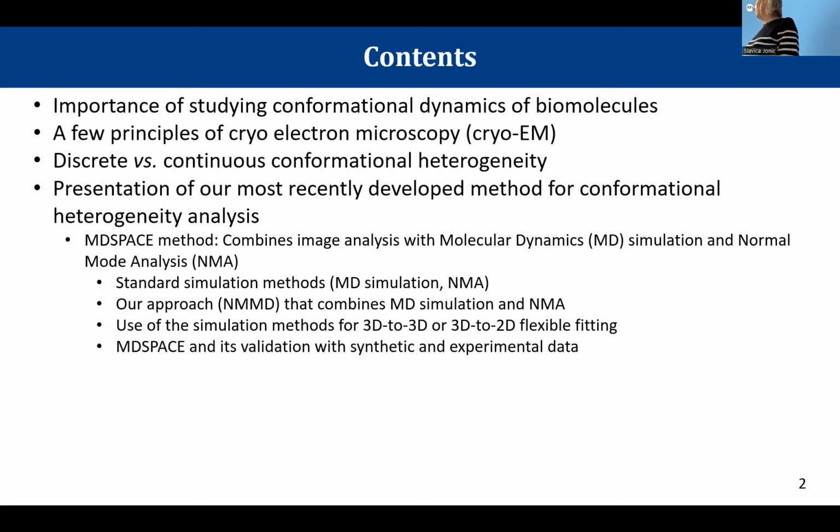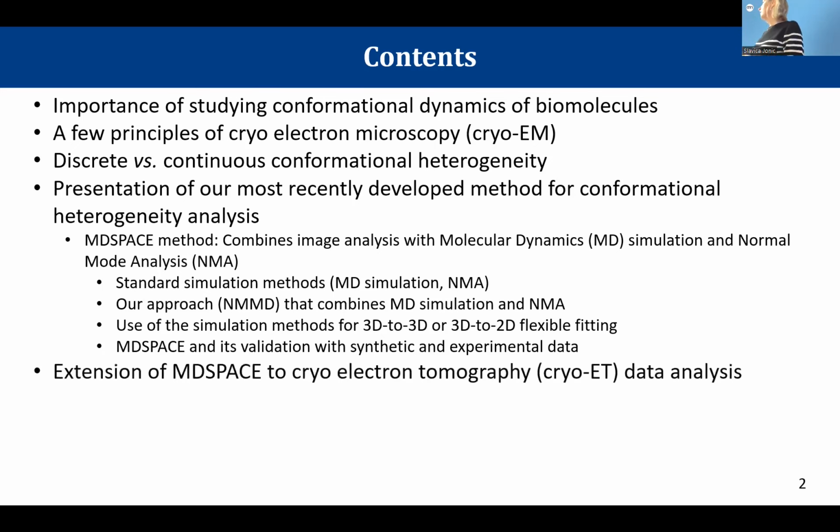And then I will present this MD-SPACE method that we validated with synthetic and experimental data. And then, if we have time, if you are interested, I will briefly introduce cryo-electron tomography, which is another type of data collection technique that you can do with the same cryo-electron microscope.